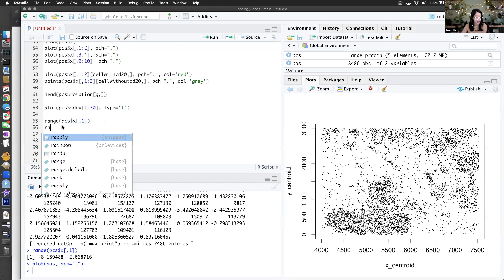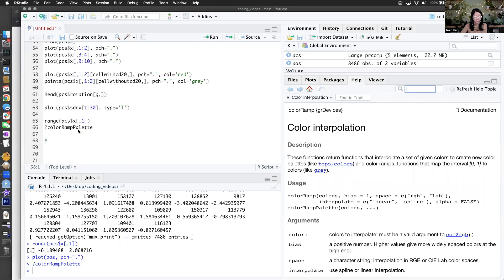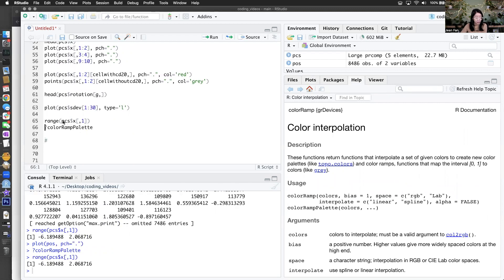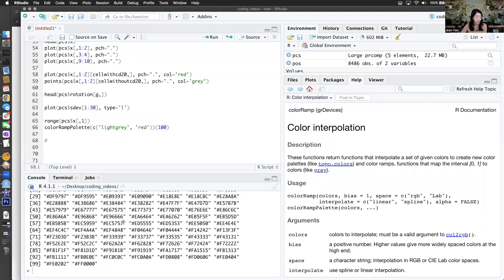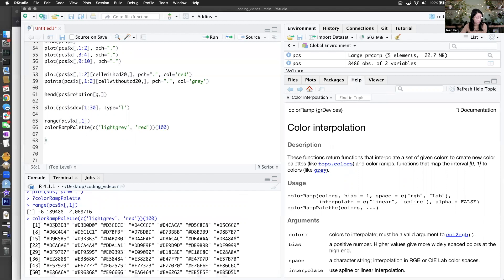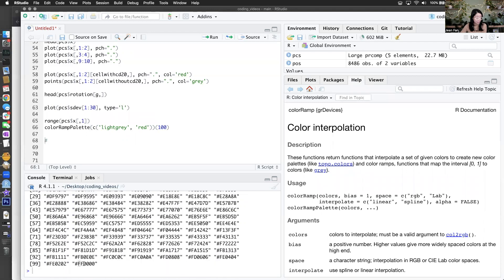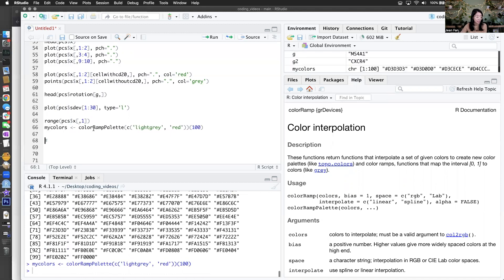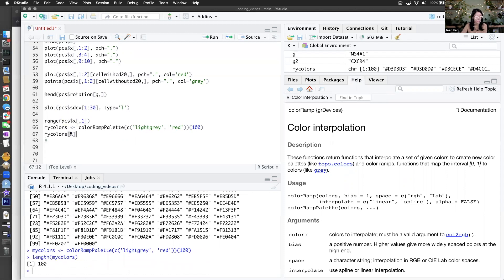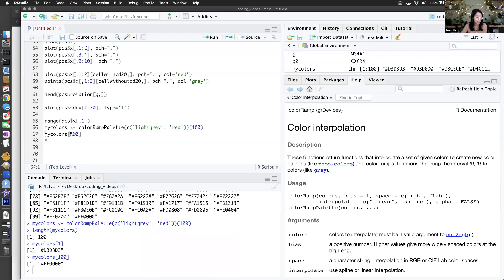How do I make a color ramp? I want to have a set of colors that I map these PC numbers onto. I'm going to create a color ramp that goes from, say, white-gray to red, with a hundred values. If you know your hexadecimal colors, you can know that this is gray and this is RGB red. So these are my colors — a vector of length 100. If I ask for the first, my color is going to be gray; if I ask for the hundredth, it's going to be red. Now I want to map my PCs to this range.